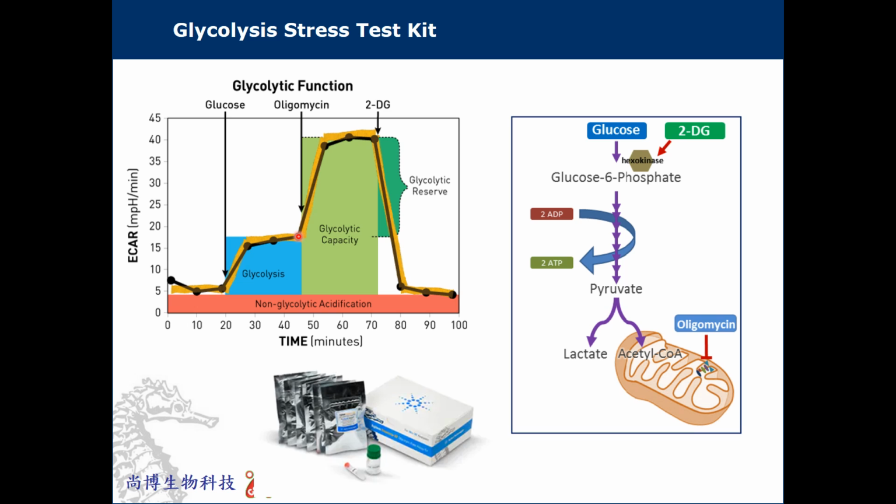If your cell has a good glycolysis function and a good mitochondrial function, and at this time you close your mitochondria, your good glycolysis function will feed back very obviously. If your cell has good glycolysis but poor mitochondria, then as you shut down your mitochondria, your glycolysis can still work enough.